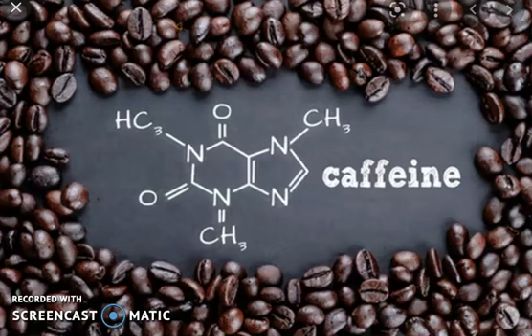Then add 5 to 8 milliliter of hot acetone to dissolve the crude caffeine and transfer the solution to a 50 milliliter Erlenmeyer flask for recrystallization. Add a few drops of petroleum ether until you reach the cloud point. Caffeine is less soluble in this mixed solvent and is just beginning to precipitate. And then cool the solution. If you do not get a precipitate, you may have used too much acetone. Carefully boil off the excess on a steam bath using a boiling stick for smooth boiling.